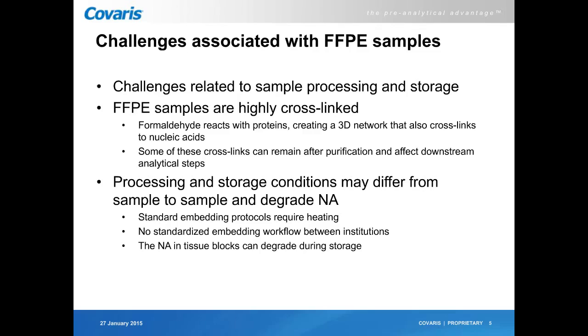Processing and storage conditions may also differ from sample to sample and degrade nucleic acids. Standard embedding protocols will require heating, and there is no standardized embedding workflow between institutions. So we'll see large variations between samples. And also, the nucleic acids in the tissue block can degrade during storage, and this is especially visible when you're looking for RNA extraction.